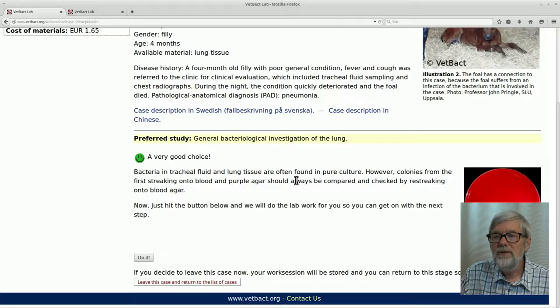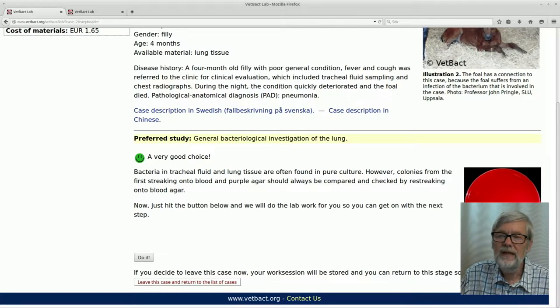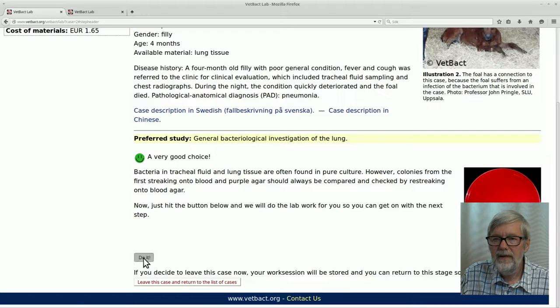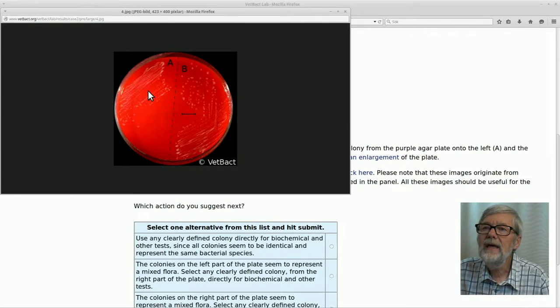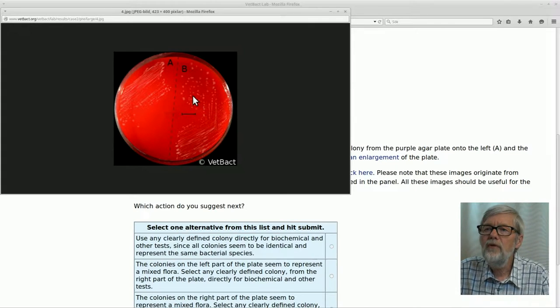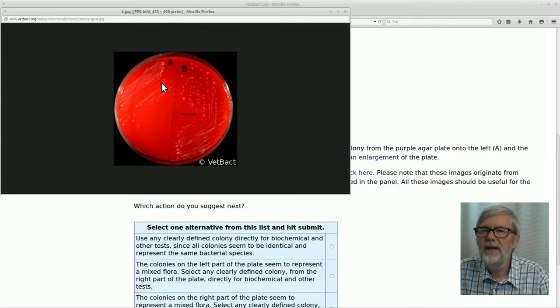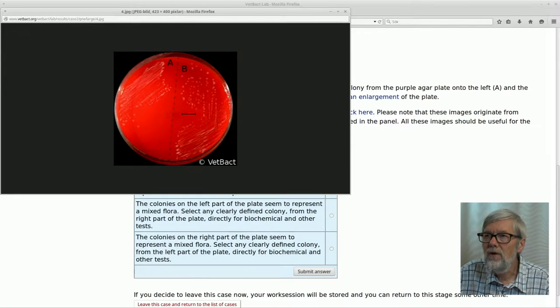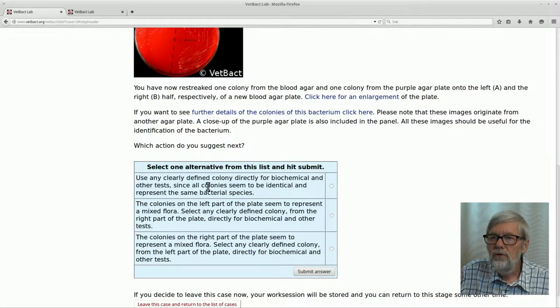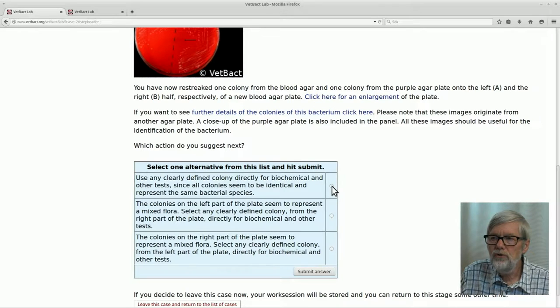What you now have to do is to streak these two colonies — one and five — on another blood agar plate to compare them with each other and check if they are the same. You have the plate here and you streak them by clicking on this link. The plate is divided into two parts: part A has colonies from the blood agar and part B from the purple agar. If you inspect these colonies carefully you will see there is no difference in appearance between part A and part B. So you can use any clearly defined colony directly for biochemical and other tests.